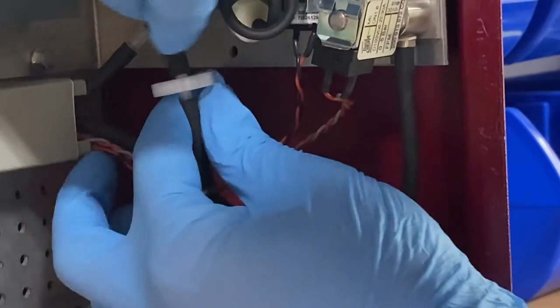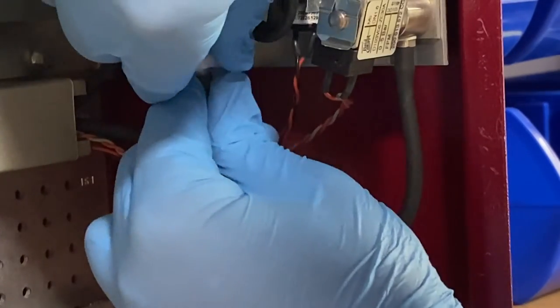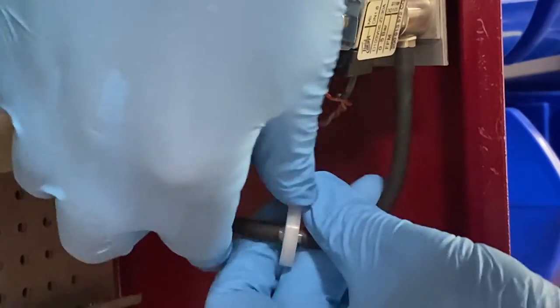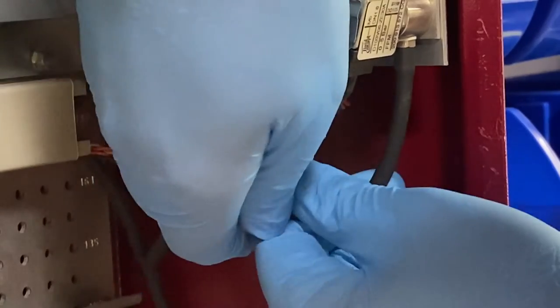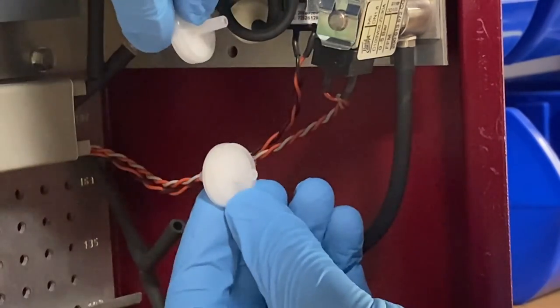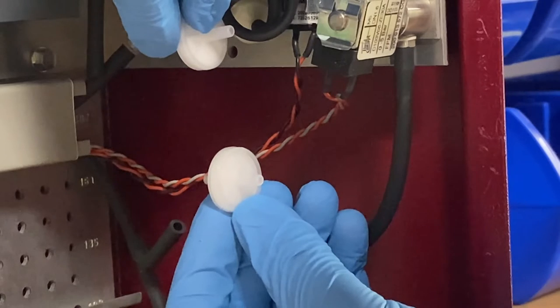To remove both filters simply unfasten the tubing from both sides. No special tools should be required, however do be aware that the tubing will probably have tightened with use.